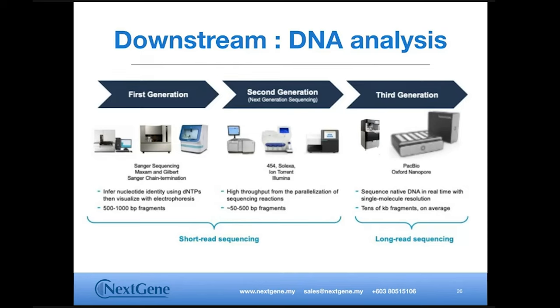So with modern technology and advancement, the third generation analysis has been discovered. From here, it can be used for assembly of microbiomes and WGS for a species. An example of third generation sequencing would be the Oxford Nanopore machine.